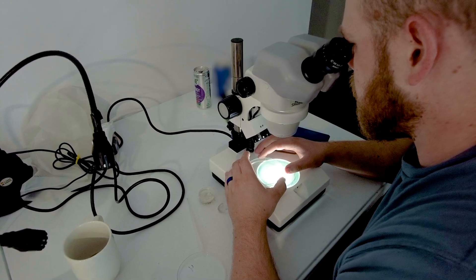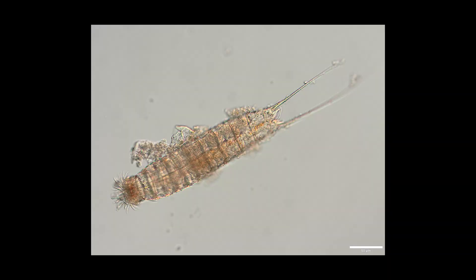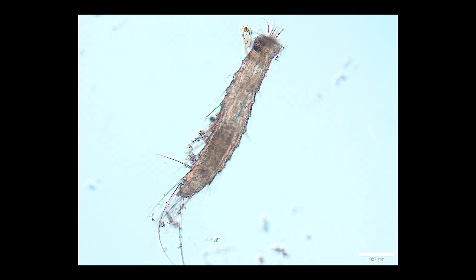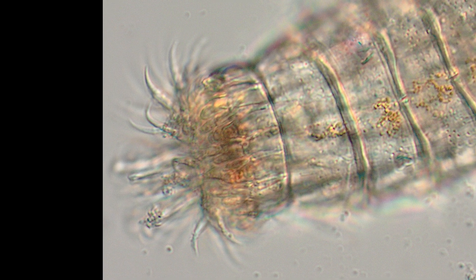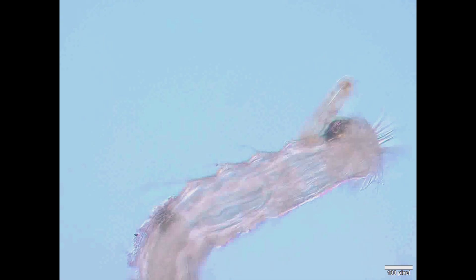We take our sample back to the scope and look for mud dragons. After many attempts and bubble and blotting, finally we find one. This is a Kinorhyncha, also known as a mud dragon. Their body is composed of 11 pleat-covered segments and a head region with a reversible proboscis. The proboscis on these is really cool because it's covered in dramatic spines called scalids. It wasn't easy tracking down a mud dragon, but that difficult quest to find them makes me feel they truly lived up to their fantasy-esque name.